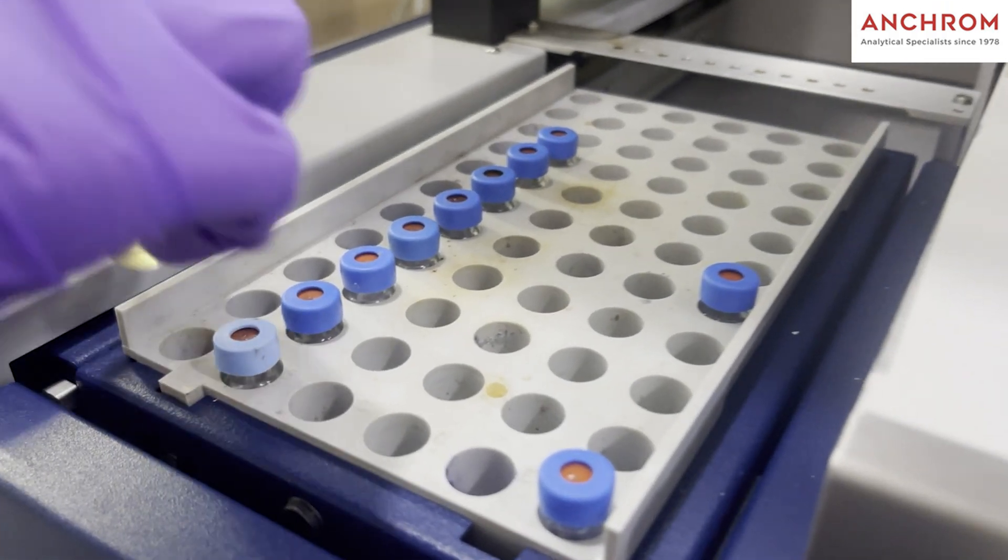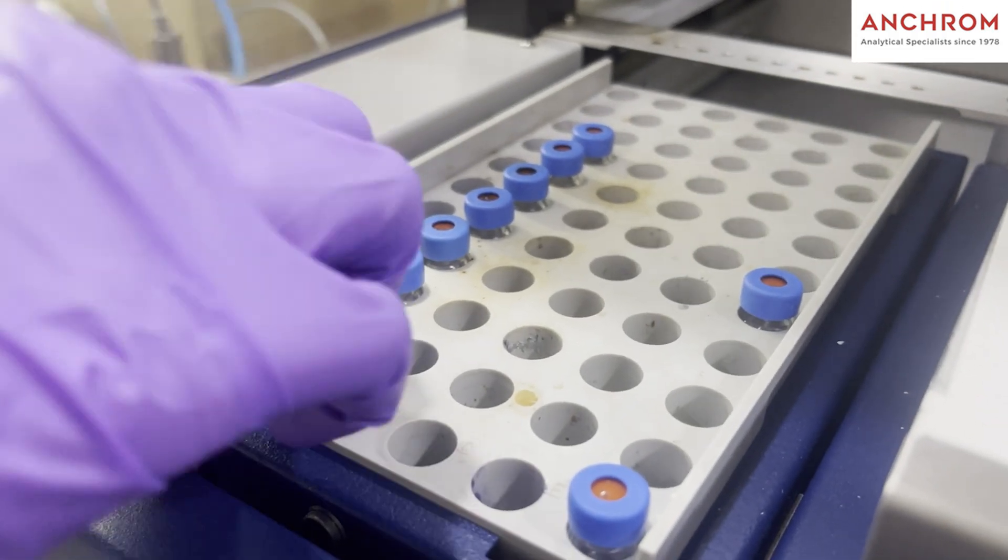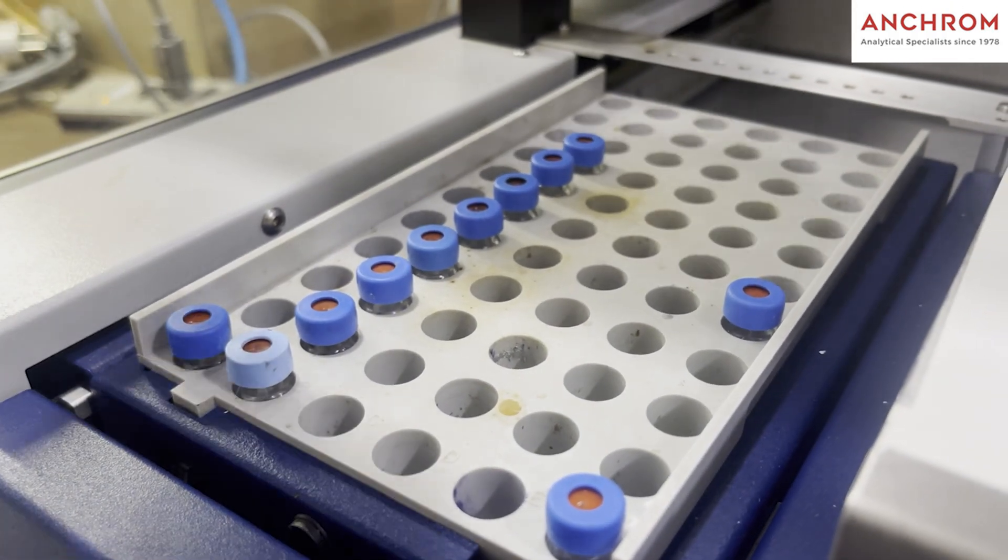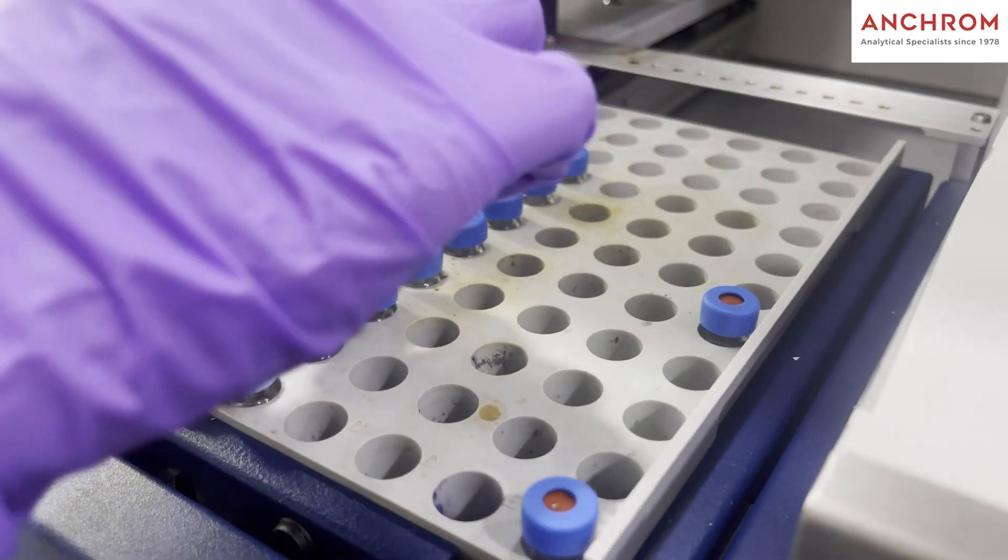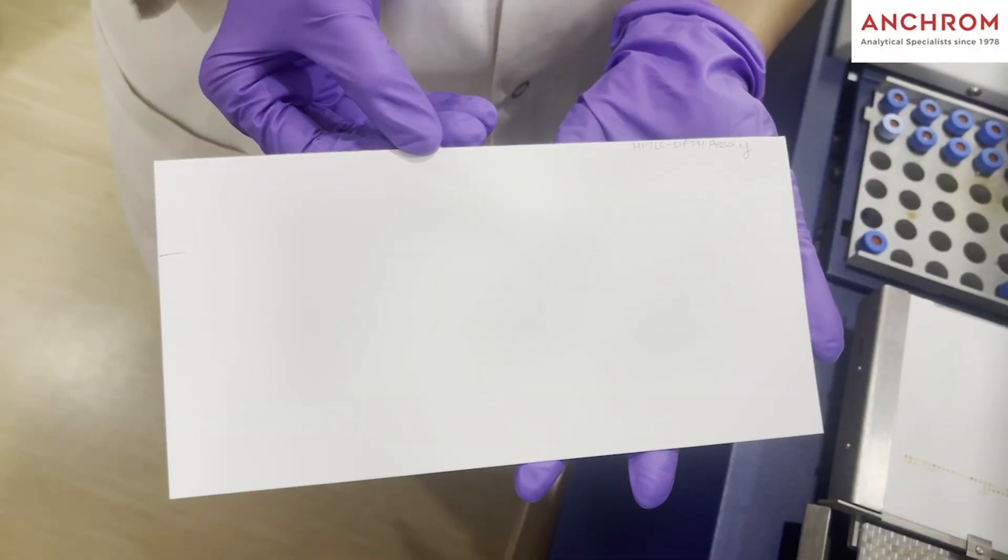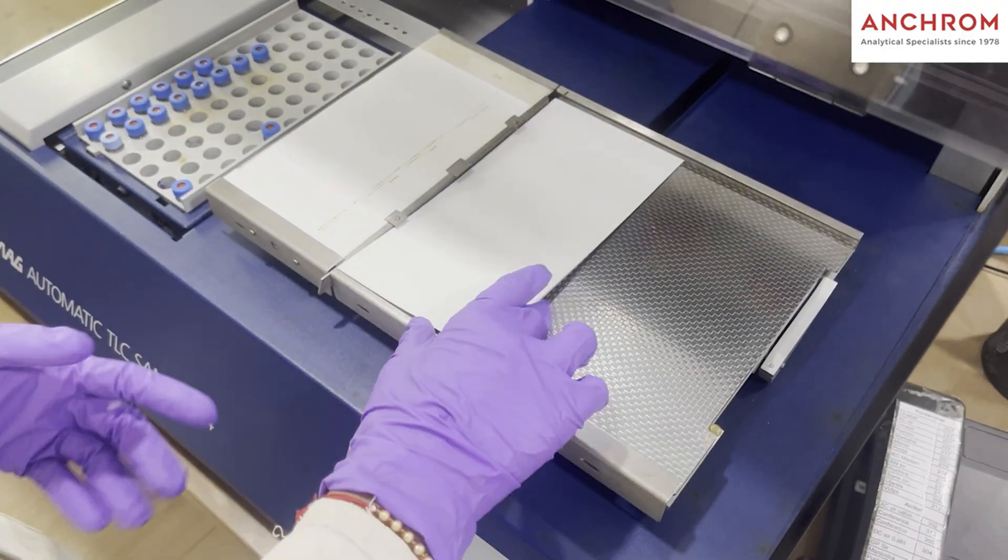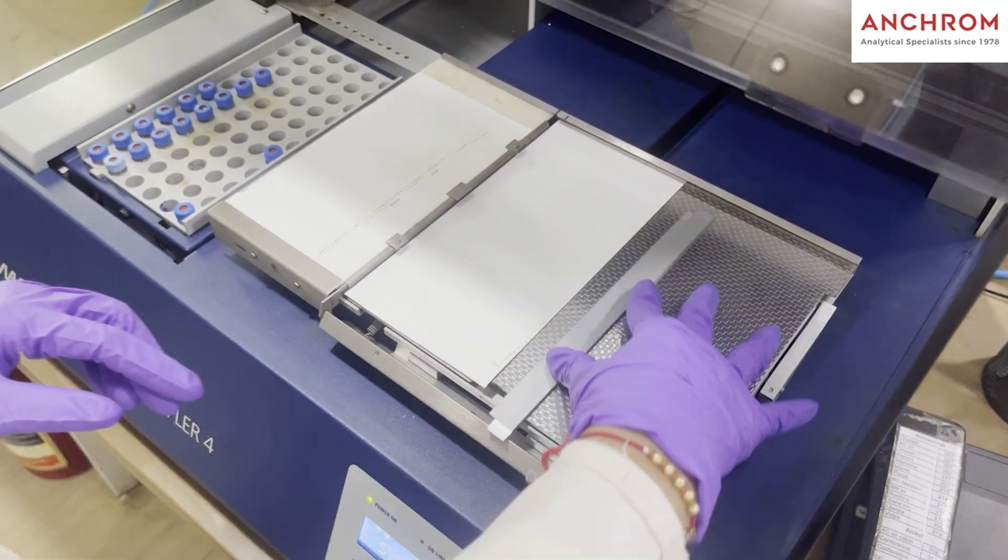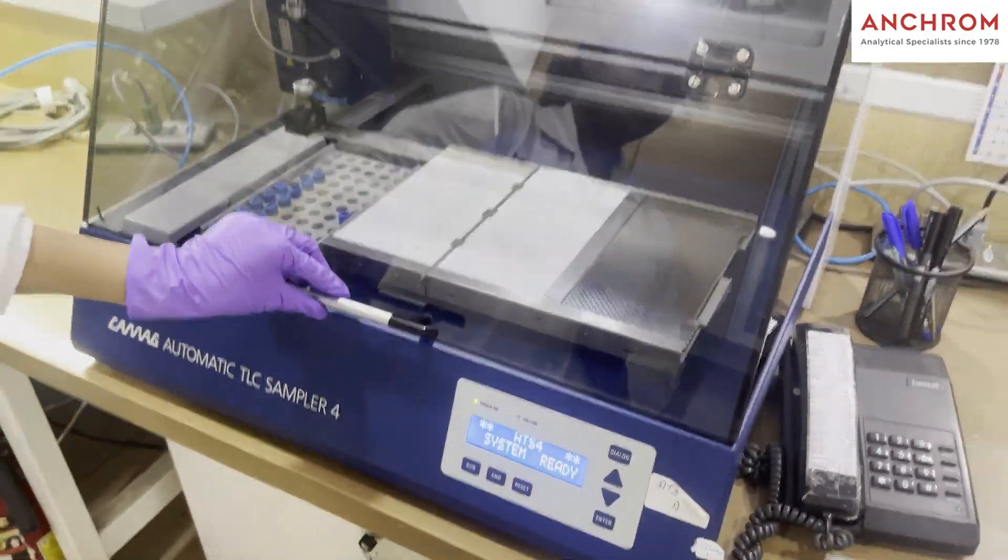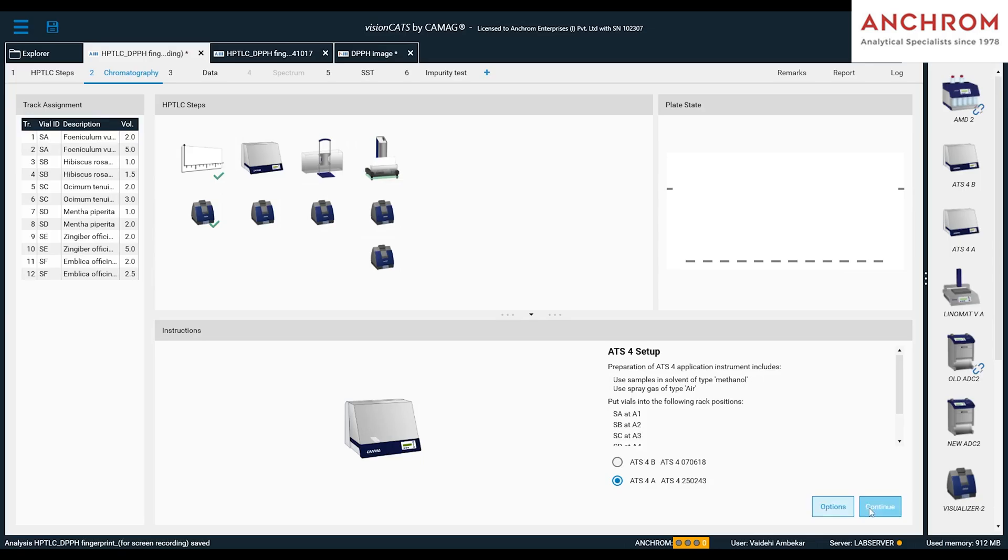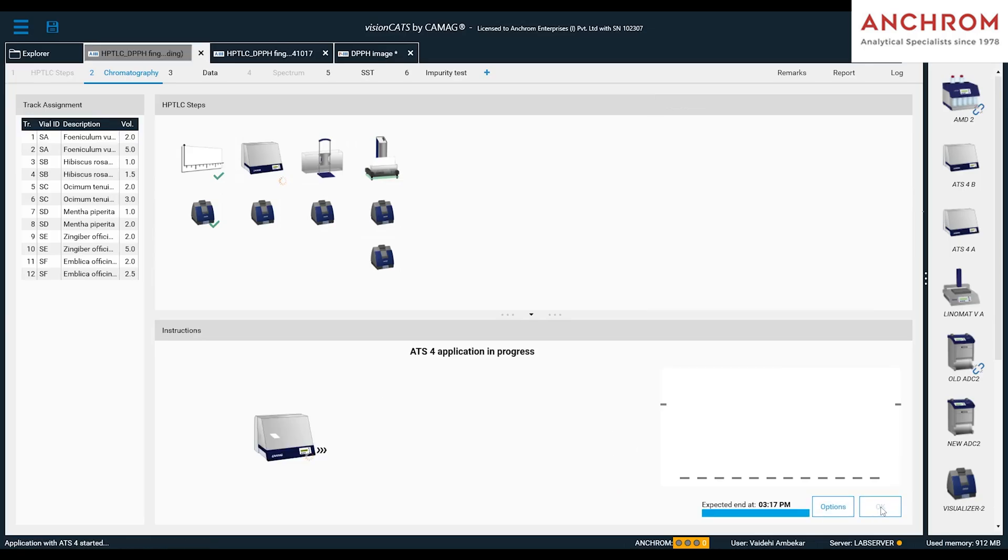For that, place the samples at the respective VL position in the ATS4 and then position the plate on the plate stage. In the software, click continue to start the sample application.